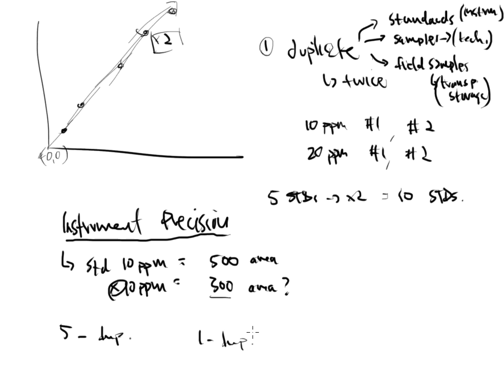Sometimes it's not just as simple as making 5 standards and running them and calling it a day, right? So this could be part of the quality control, quality assurance procedures that a laboratory company will require of you, and now you know a little bit more about it.